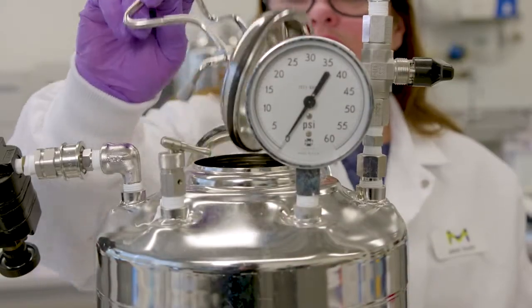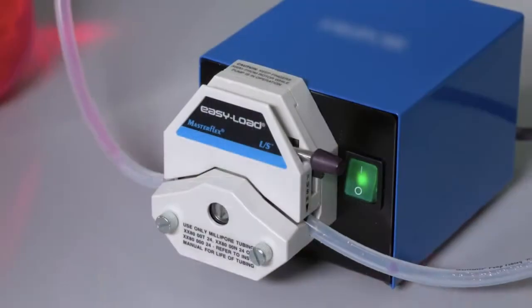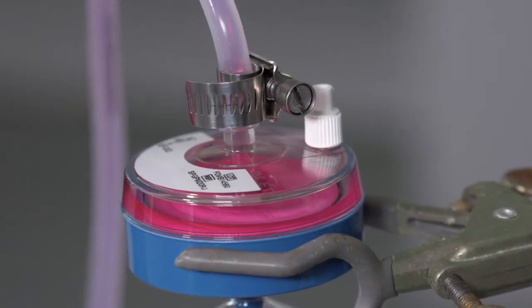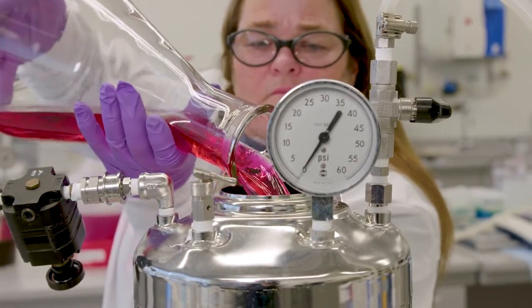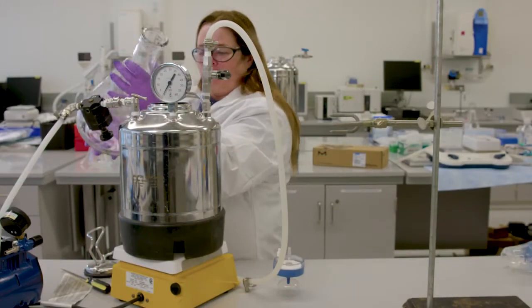Set up a 10 to 20 liter volume pressure vessel, or alternatively a peristaltic pump could be used. This filter device can be used to filter most aqueous solutions and medias, but check user manuals for chemical compatibility. Always follow usage and safety precautions and guidelines when using pressure.